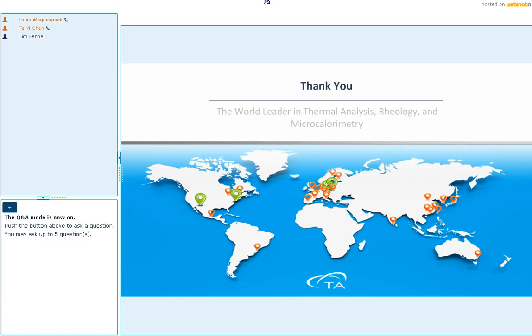It's because DMA clamps are non-disposable. If you load your sample and let the sample cure between the clamps, that's going to be a really expensive test. So most thermosetting curing analyses are conducted using a rheometer with disposable plates. I would highly recommend you consider using disposable plates on a rheometer to perform your curing analysis. It's not that you cannot do it on a DMA, but if you ever glue the whole clamp together, you're not able to separate them.